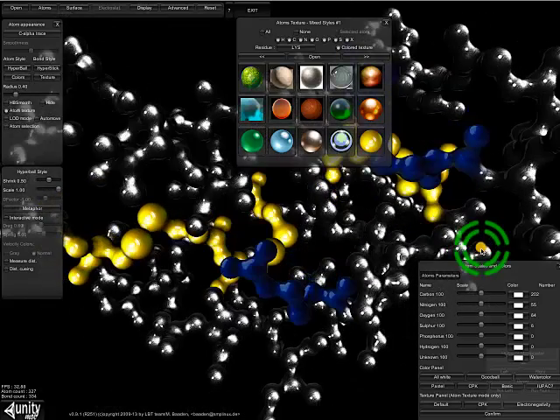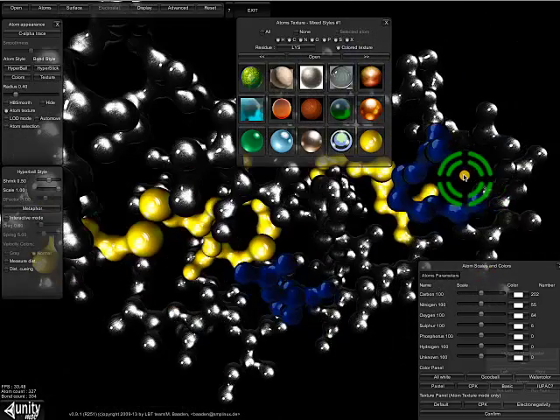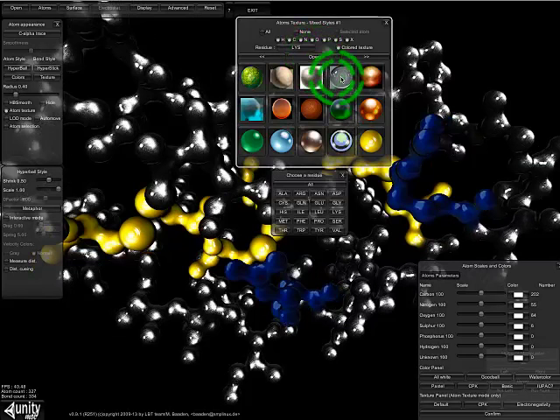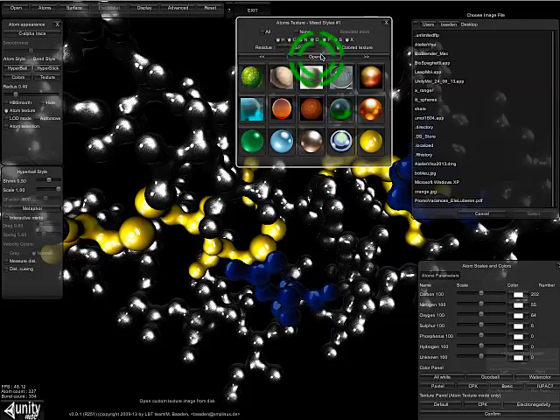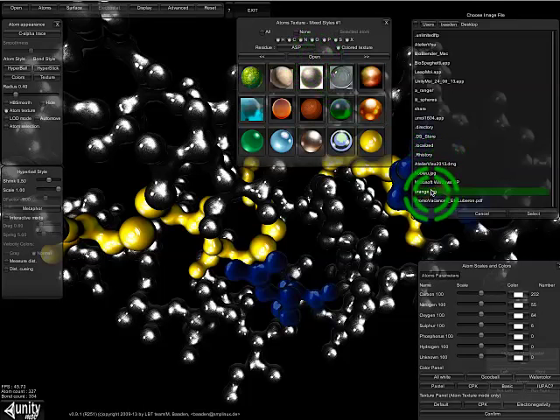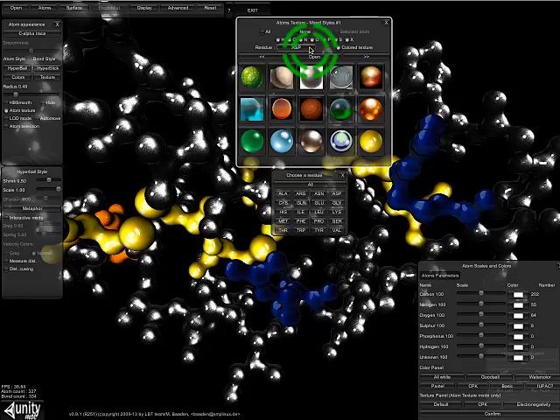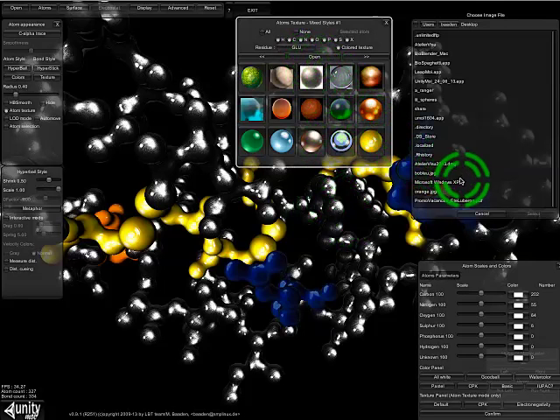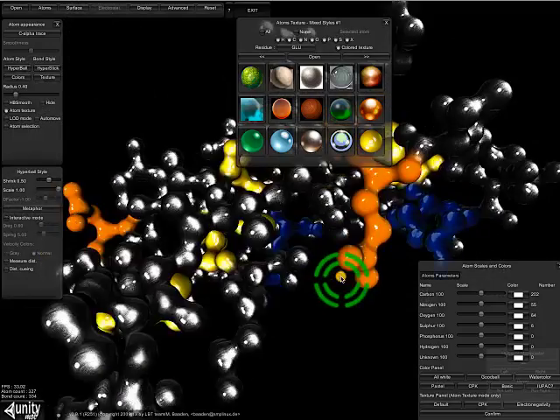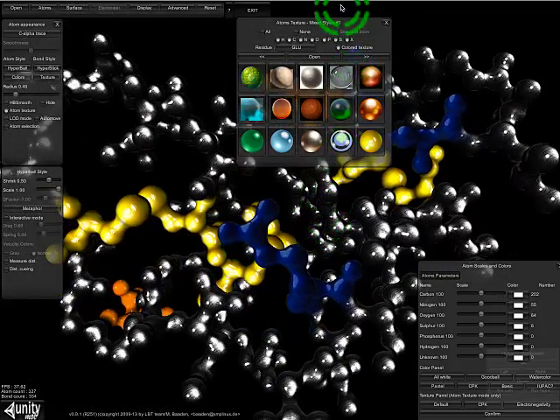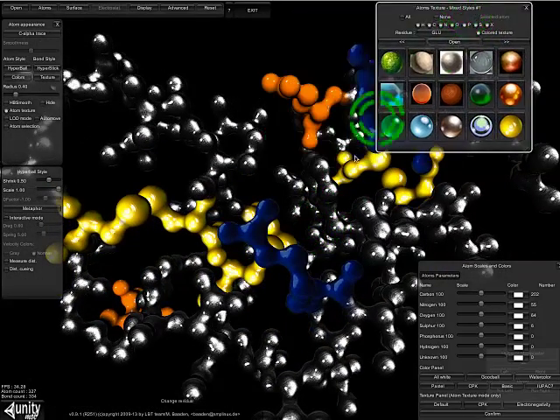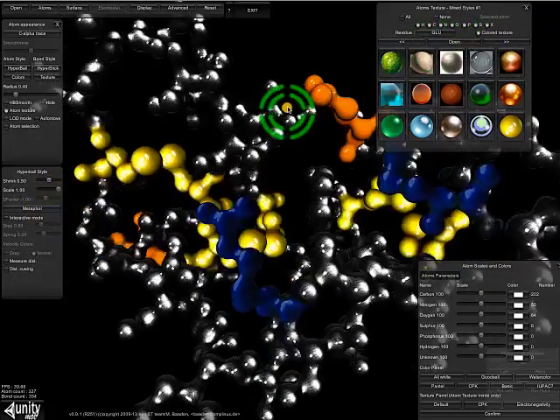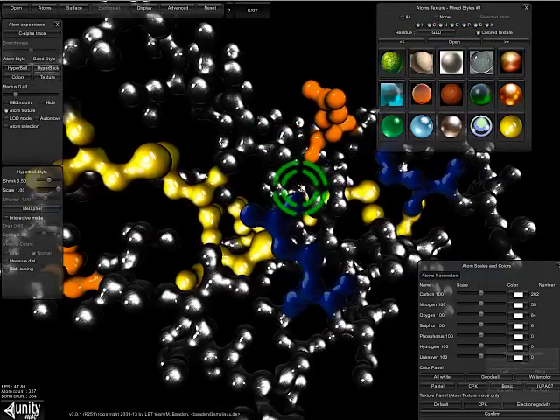We can also color the acidic residues like the aspartate. Let's give them a more flashy color, something maybe like an orange. And also the glutamates, which are here, also attribute them some orange. And now you have colored the different residue types, which you could highlight in the structure very nicely.